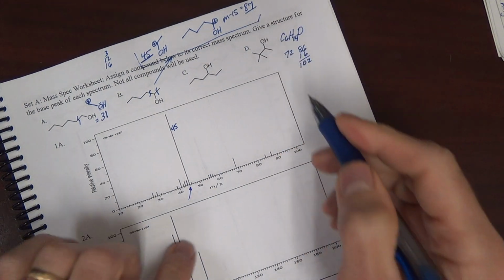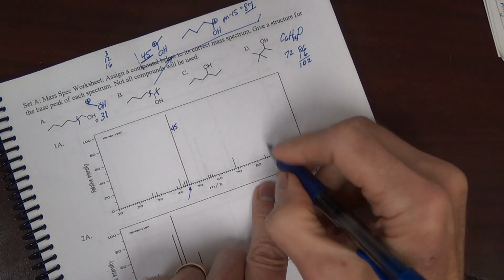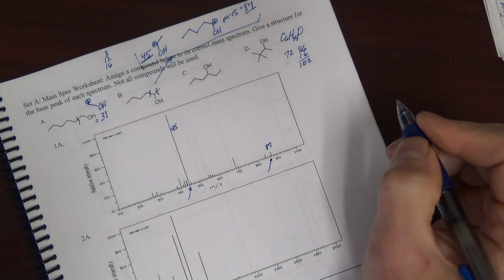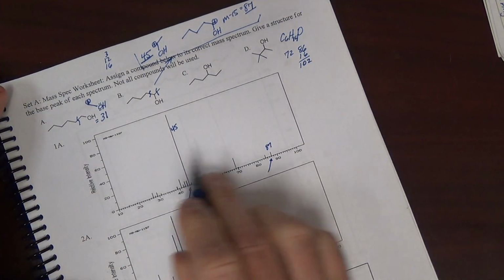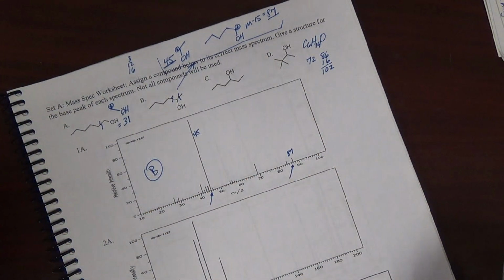I also expect an 87. Does this spectrum show an 87? Well, yes, it does. And so this spectrum has both peaks that we expect. I think this is compound B.